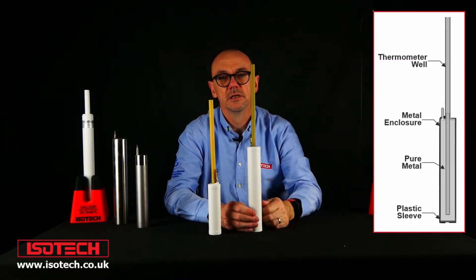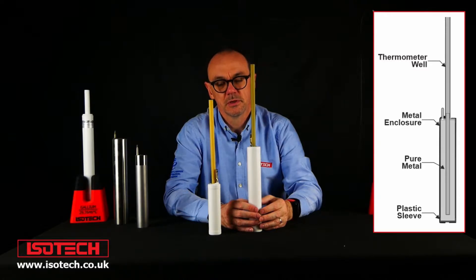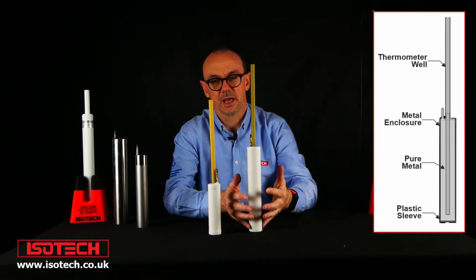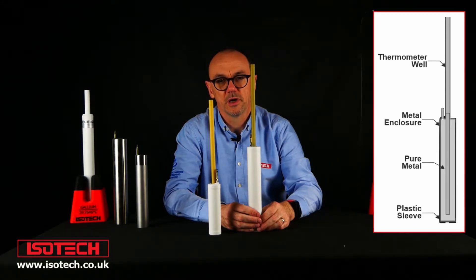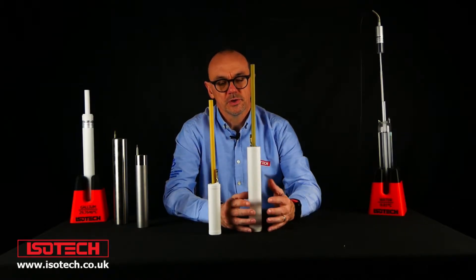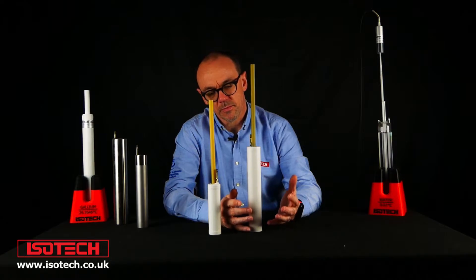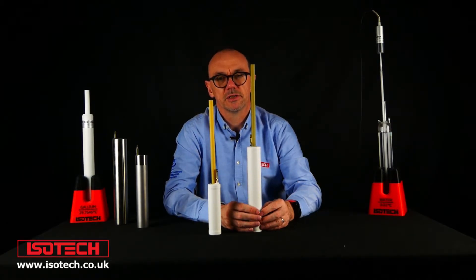The cells are invariably made from stainless steel and then they have a plastic outer casing, but the stainless steel is the crucible containing the pure mercury. The mercury is very pure — seven or eight nines pure mercury. To calibrate, we need to realize the mercury triple point, that's minus 38.8344 degrees C.